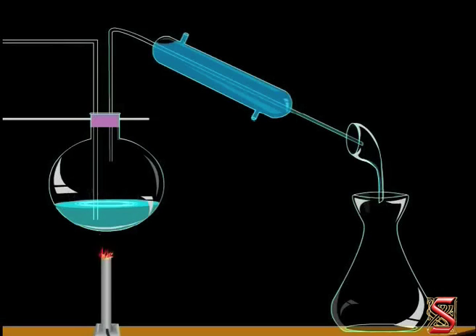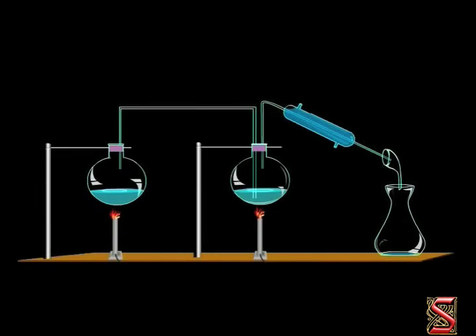Then we will have the two phases, aqueous phase and organic phase. These two phases will be separated by using a separating funnel.